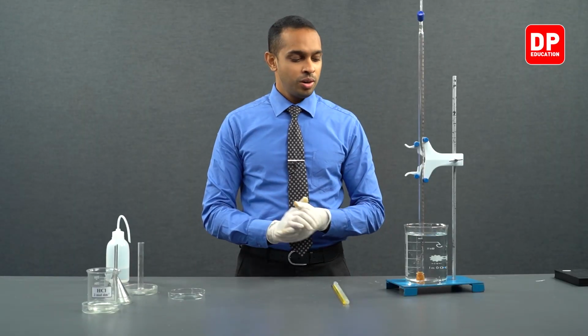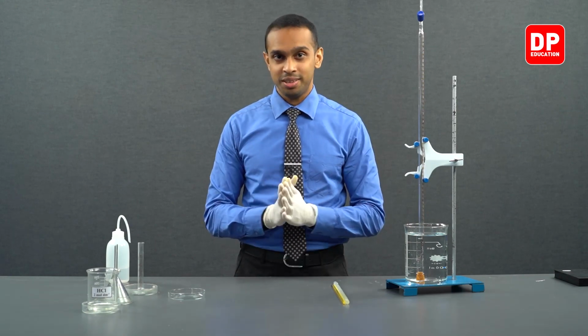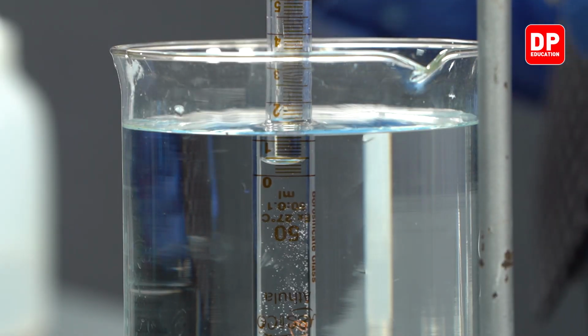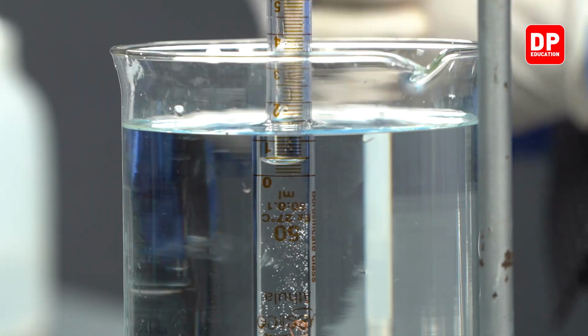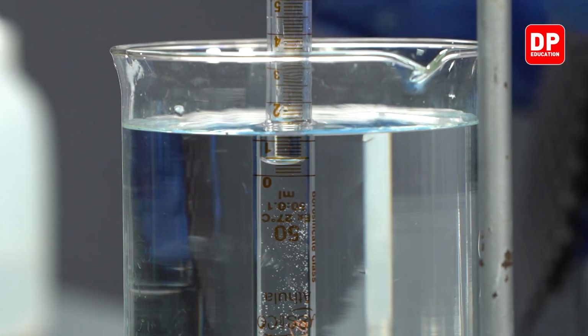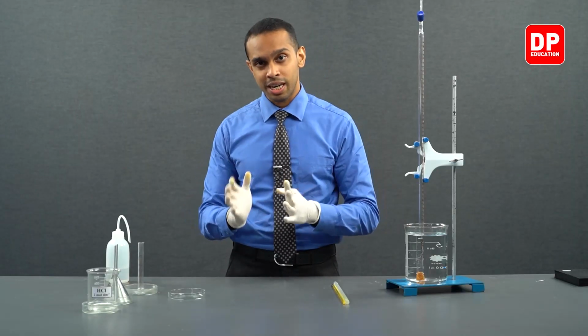Now, all of the magnesium that was in the burette has completely reacted. After all of the magnesium has completely reacted, what we see here in the burette is the hydrogen gas that was produced due to the reaction between the magnesium and the hydrochloric acid.